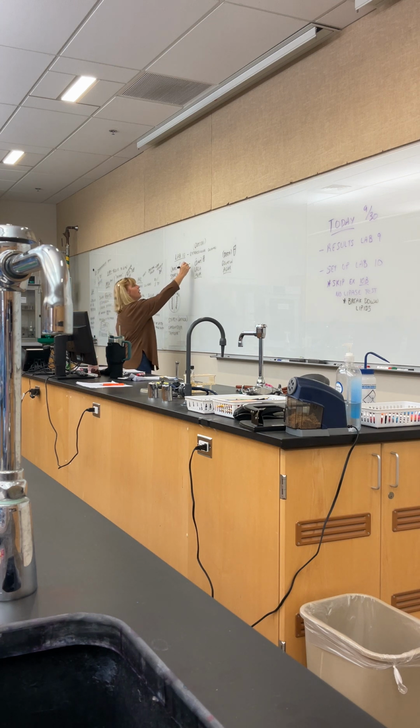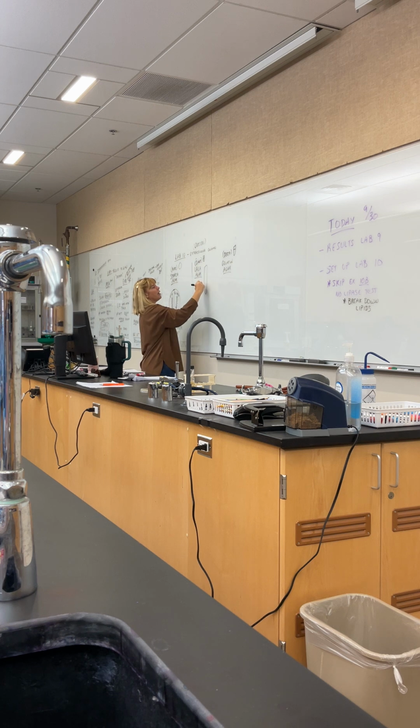Okay, you're also going to be setting up a urea slant. So remember, the slants are the ones that have kind of a slope to them. And the way you're going to set that up is you're going to put your loop to the base of the slant.